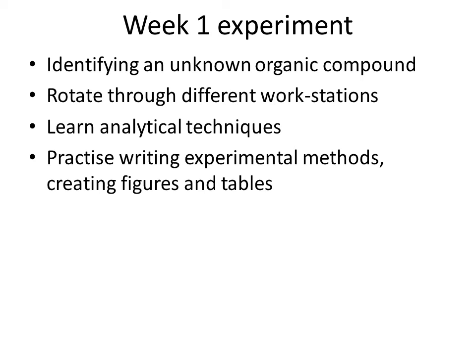In the first experiment, you will be given the task of identifying an unknown organic compound. You will work individually, but your group will rotate through different workstations that will let you collect data about your unknown. This lab will be a chance for you to learn and practice key analytical techniques that you will use through the rest of your course.